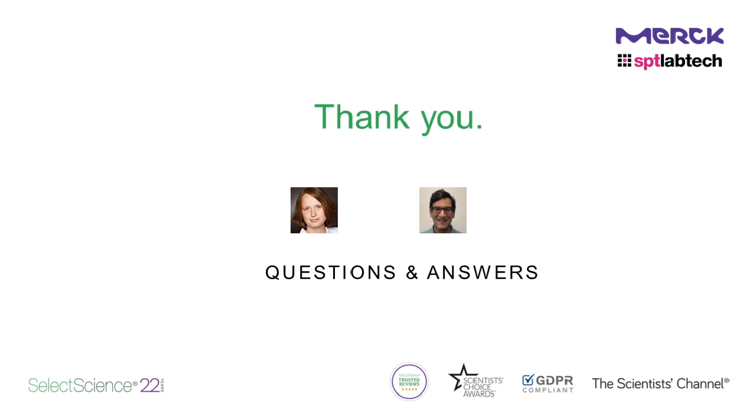Okay, so the next question we've got is, do you also use DFD to make compound dose responses or only reagent distribution? Okay, so we use the dragonfly for reagent distribution, that's right.